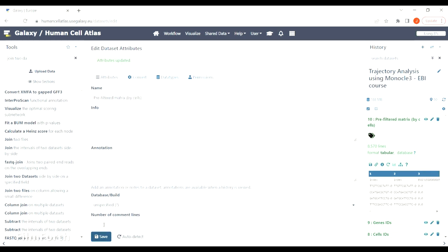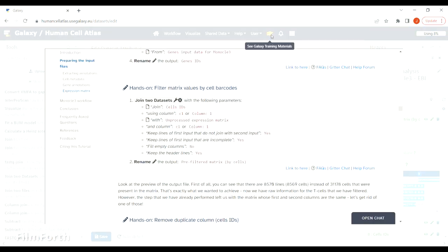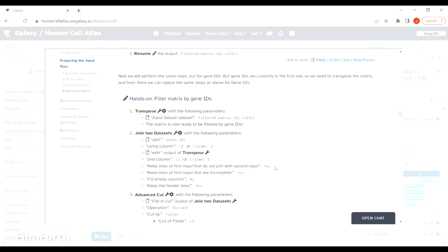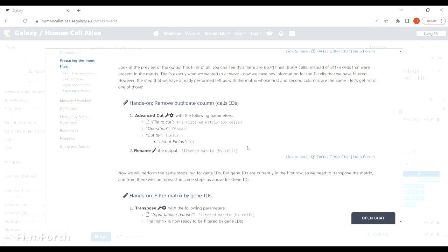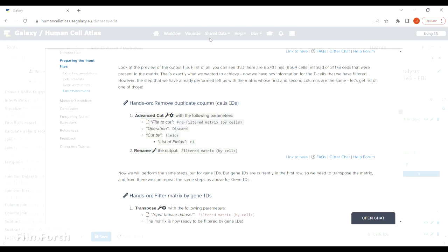By this operation we added a column that is the same as the one we already have, so the next step in the tutorial will show you how to remove it.